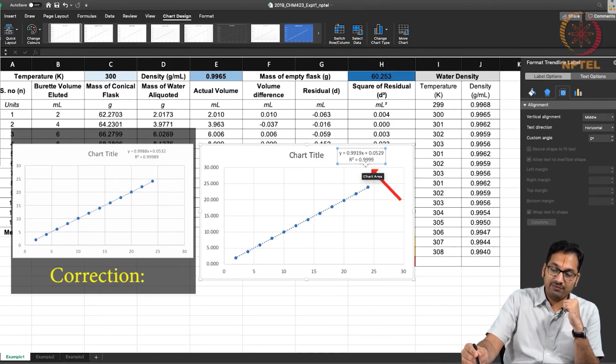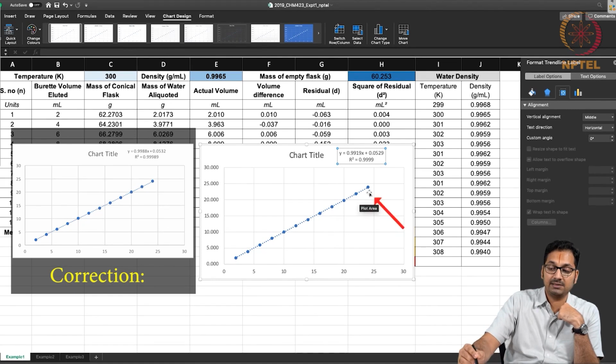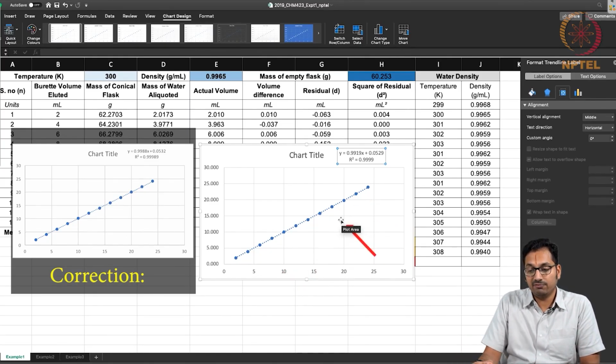And of course, the fit makes you happy in this case because the fit seems to be quite reasonable, where all the points are in fact contained within the fitted line, which is shown as a dotted line in this case. So you are able to see that the dotted line nicely passes over each of the measured values, which indicates that you have gotten a reasonable fit.